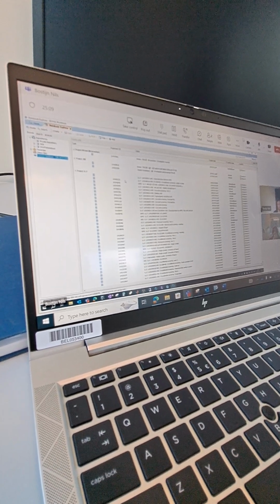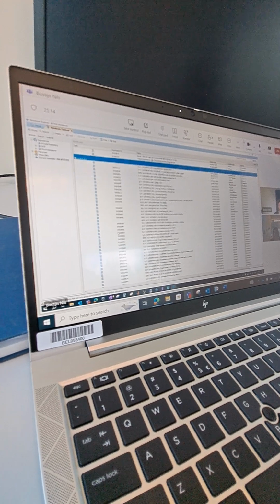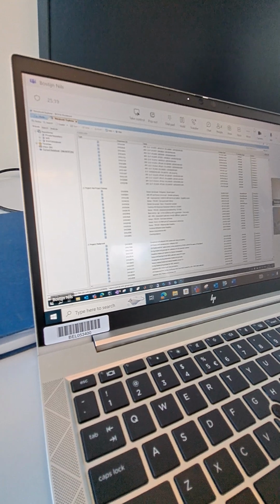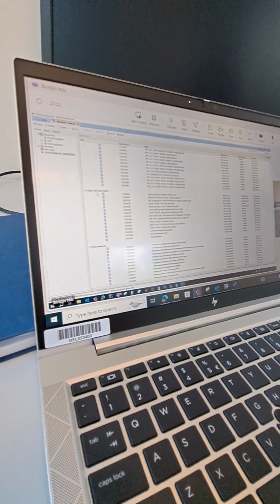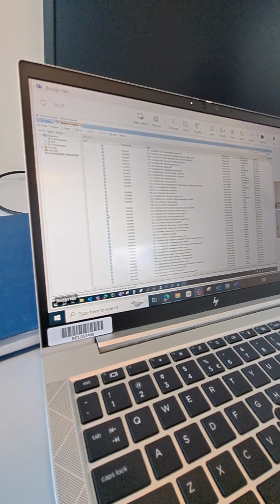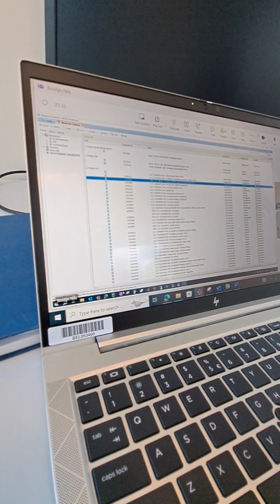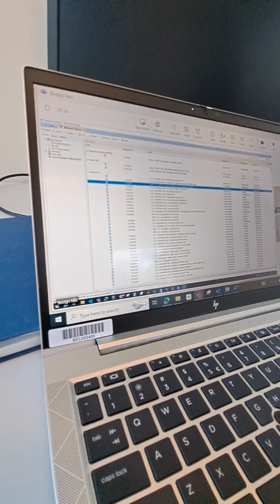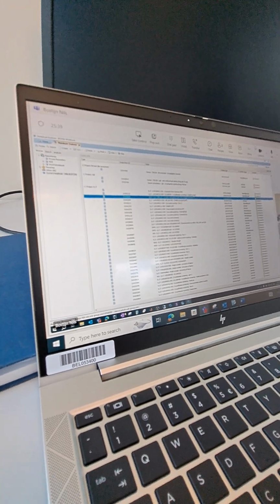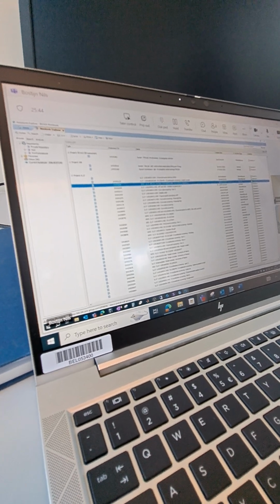For me, it's divided per project. But for you, you won't need to do this because you won't have that many ELNs. And so, the different columns we have. The first one, I don't know what this means in fact. Here you can see the ID of your experiment, the DV number, and a number. This is really the identifier of the ELN. We have then the name, the title of the ELN, and when it was created.